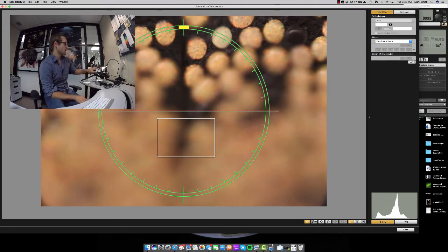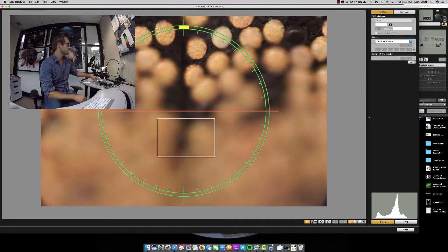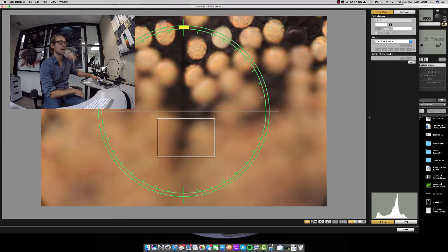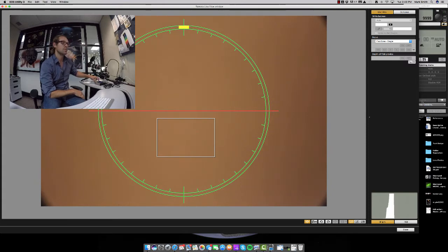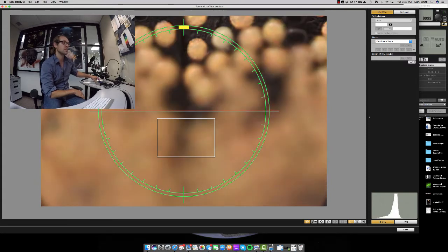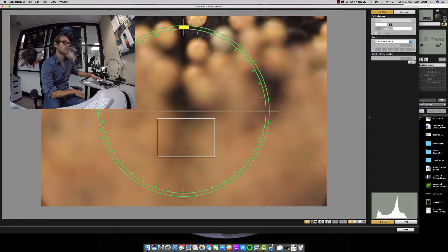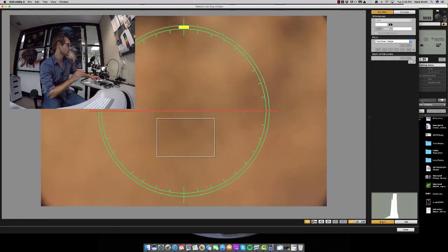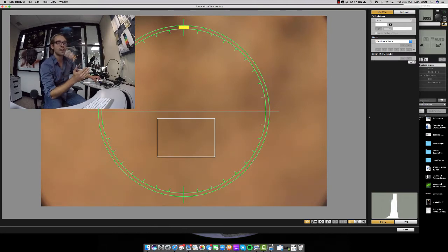Now that I've got the subject in the focal plane, we're going to set up the parameters of this image. I'm going to press the up arrow ever so slightly, just until everything just starts to go out of focus. I'm just going to tap the up arrow a few times until the motor catches. It looks like it caught there. We already shot over it a little too far. So we're just going to bring it back. One more tap and that's good. So nothing's in focus.